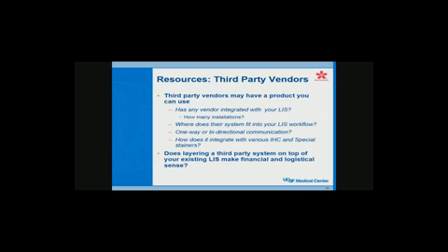And then you have to ask yourself, do you want to have those two systems? And then how does it integrate with the LIS? Where do you integrate? Again, it has to be sometime when you do an order for a stain. And so which system do you put the order in? And how do you track it?